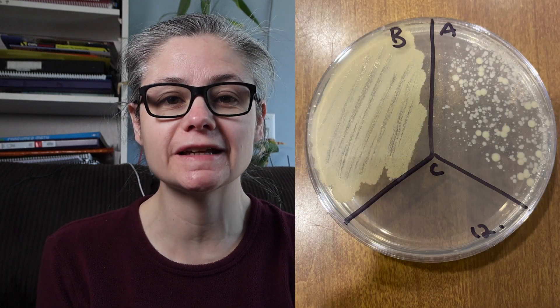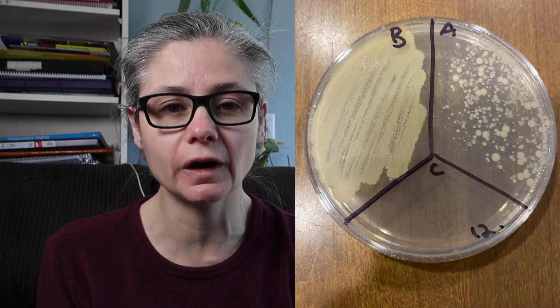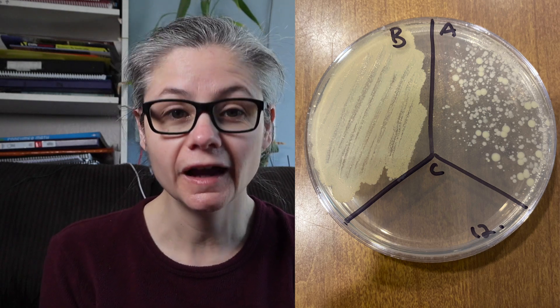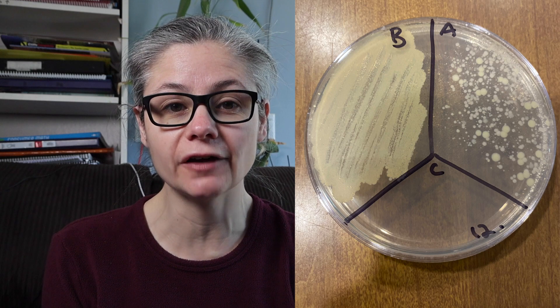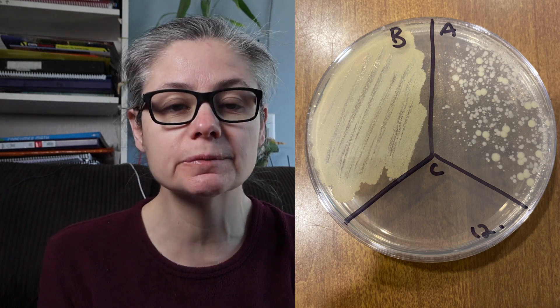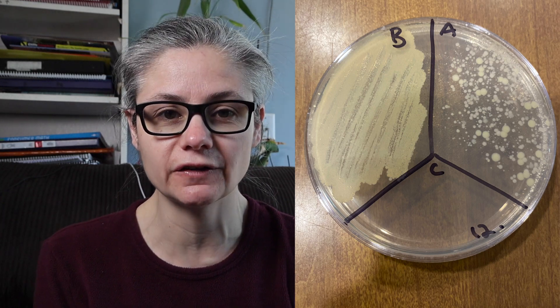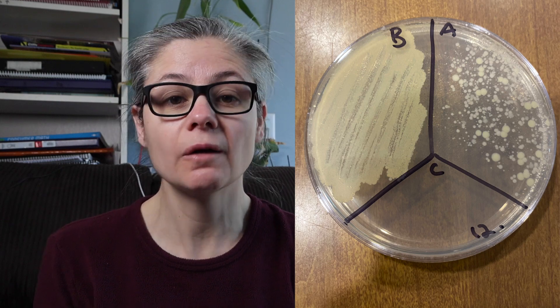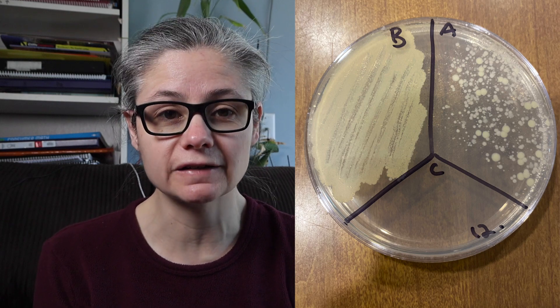Now for some results. Looking at our petri dish here, we can see the section B for before has a ton of bacteria from the toilet bowl. And this section labeled A for after, we can see a visible decrease in bacteria. It's not quite as profound as we see in some other toilet bowl cleaners, but there is a decrease in bacteria.